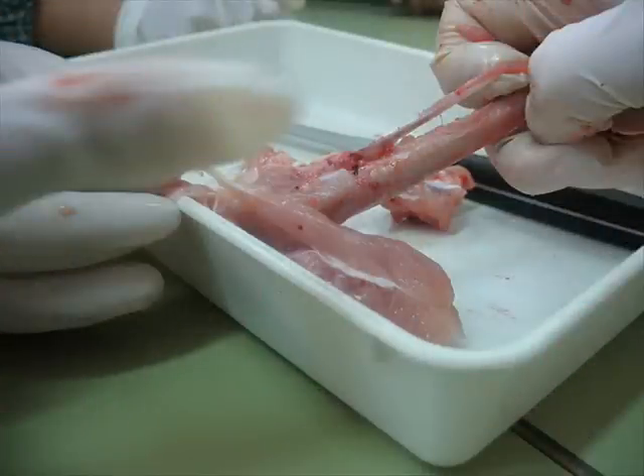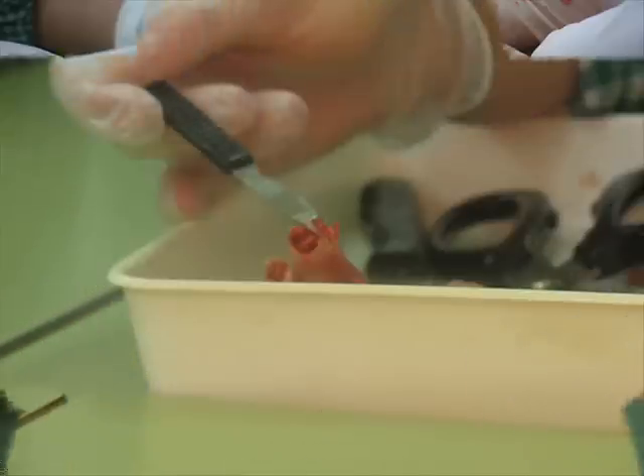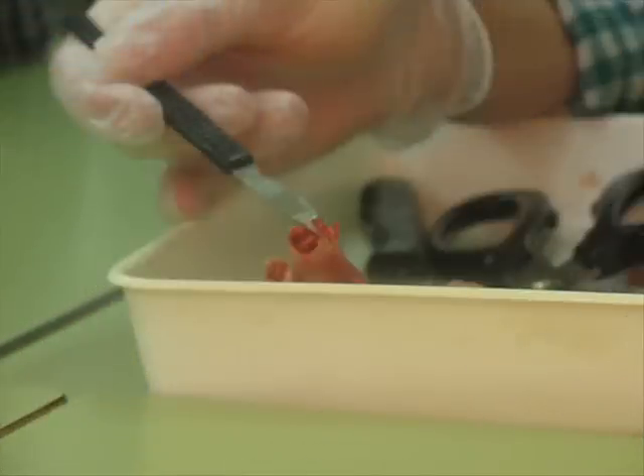Discover the chicken leg bones: fibula, tibia, femur and the knee-capped joints. Cut the bone and observe the bone marrow.